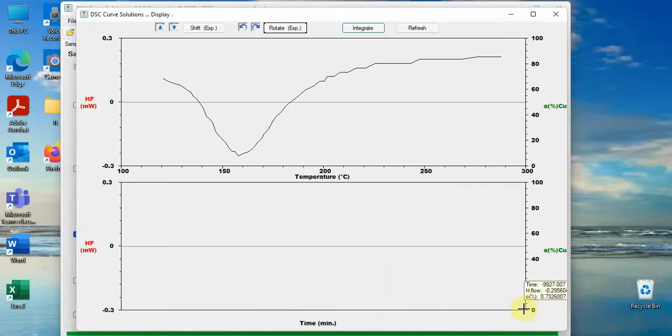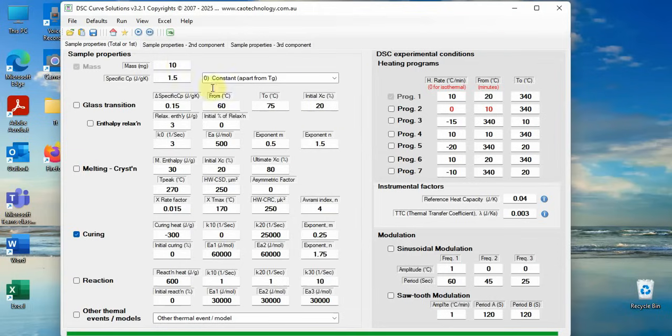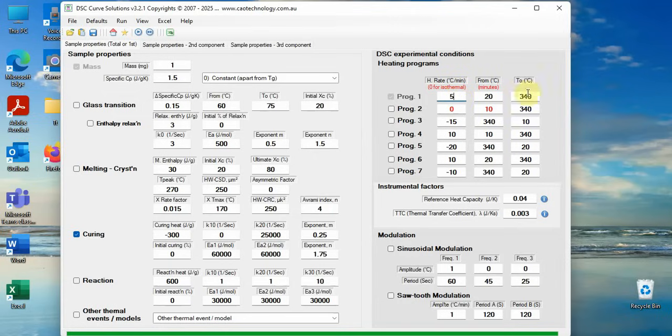First put known parameters, sample mass, heating rates, etc. to the boxes. These numbers are unchangeable. Click checkbox curing, put guess numbers to the relevant boxes, run DCS simulation.